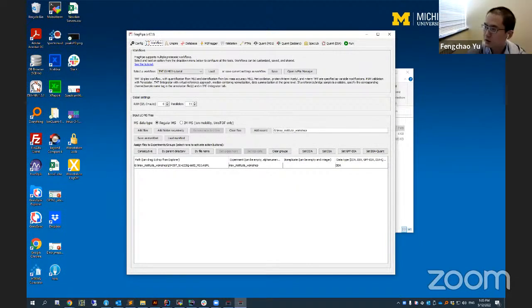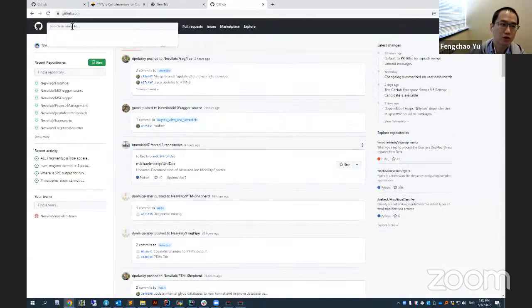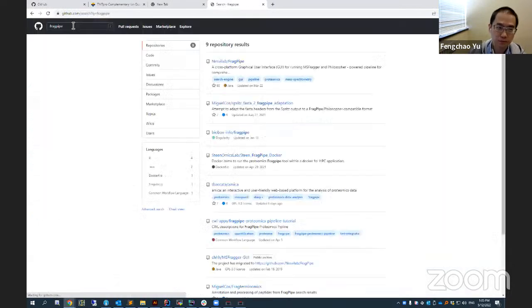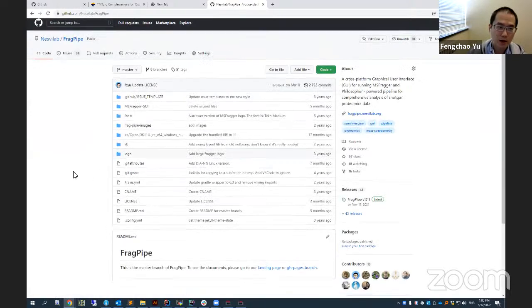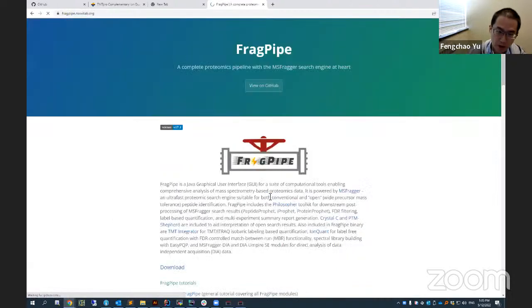Another one asks, can you send again the link about the configuration? Sure, let me just go through these things. I guess it's more important. When you go to GitHub, as Philip showed, and search FragPipe, this is basically the first one in the search result. Then you can go to the landing page, click this one, and you will go to our FragPipe GitHub tutorial page. It has a lot of resources here.